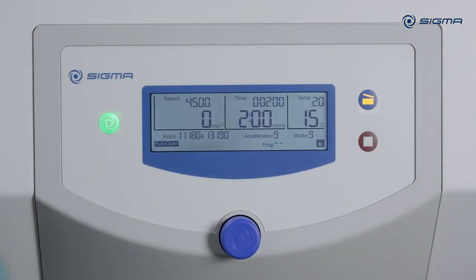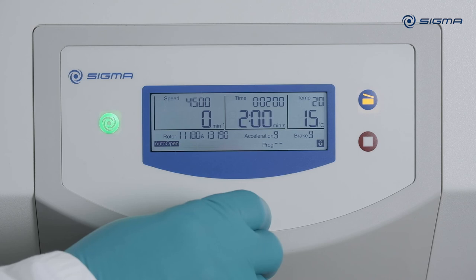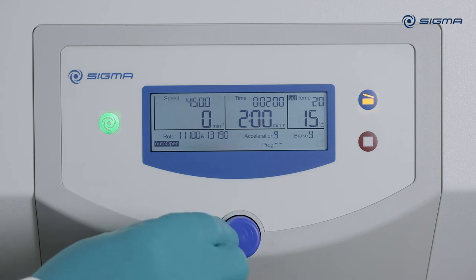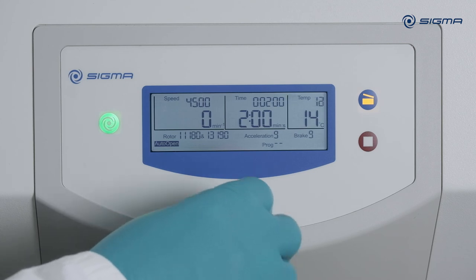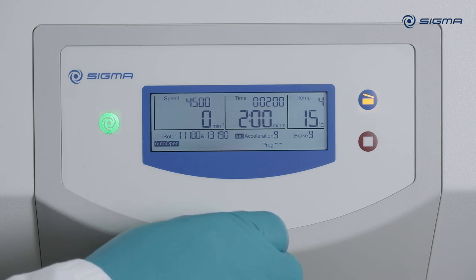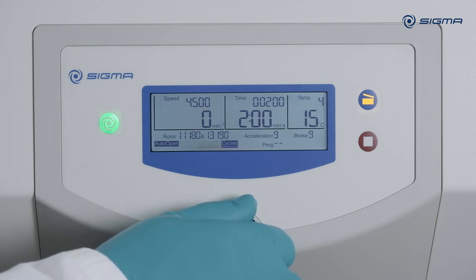You can use the rapid temp program to quickly cool the centrifuge. First select a target temperature that is lower than the actual temperature, then select the rapid temp program at the bottom of the menu and start the run.